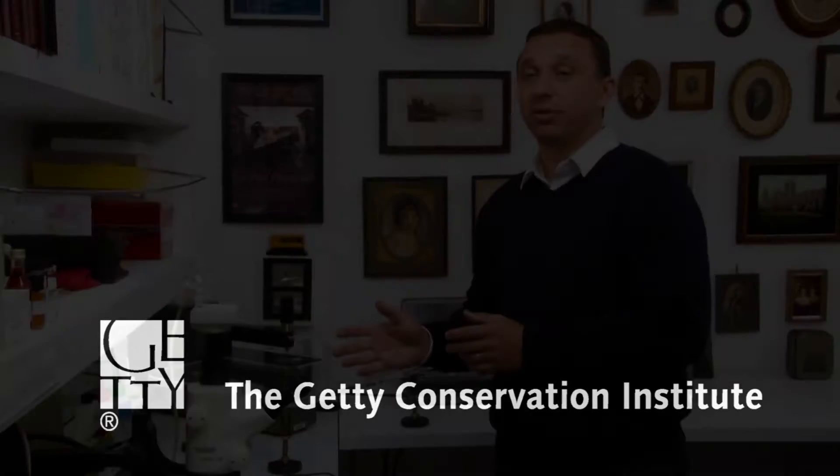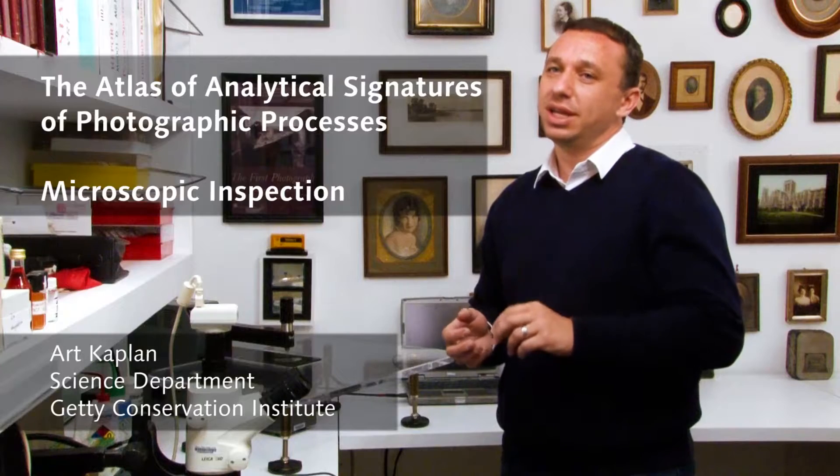This is just a regular stereo microscope and here we're really trying to identify the composition of the photograph in terms of its structure. Is the image itself sitting directly on the paper fibers? Is it separated by an emulsion layer? Is there another layer on top of it? Maybe a baryta layer in between or a coating on top of the final photograph?